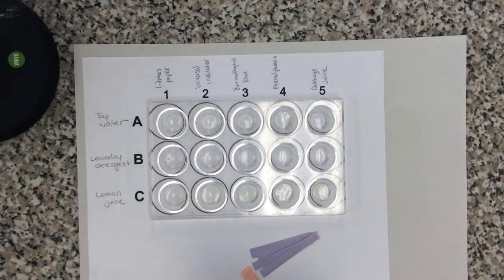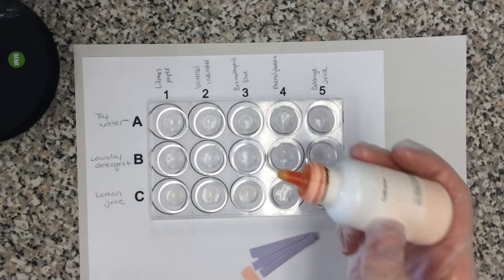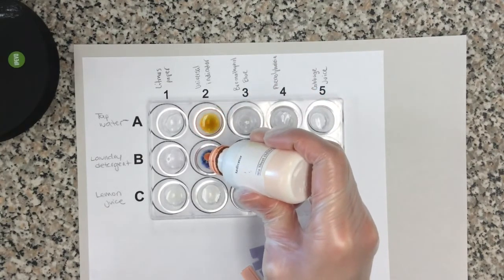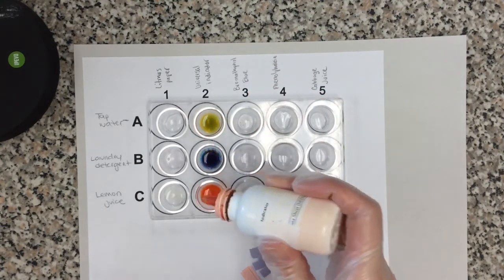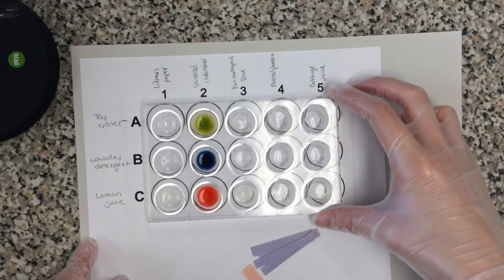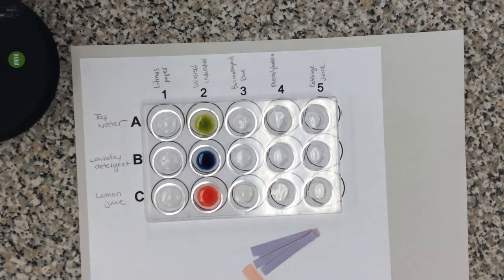And now we're going to try our universal indicator. Just need 2 drops in each well. You can see those are some very different colors. Very interesting. So, you might be thinking, what do those colors actually mean?